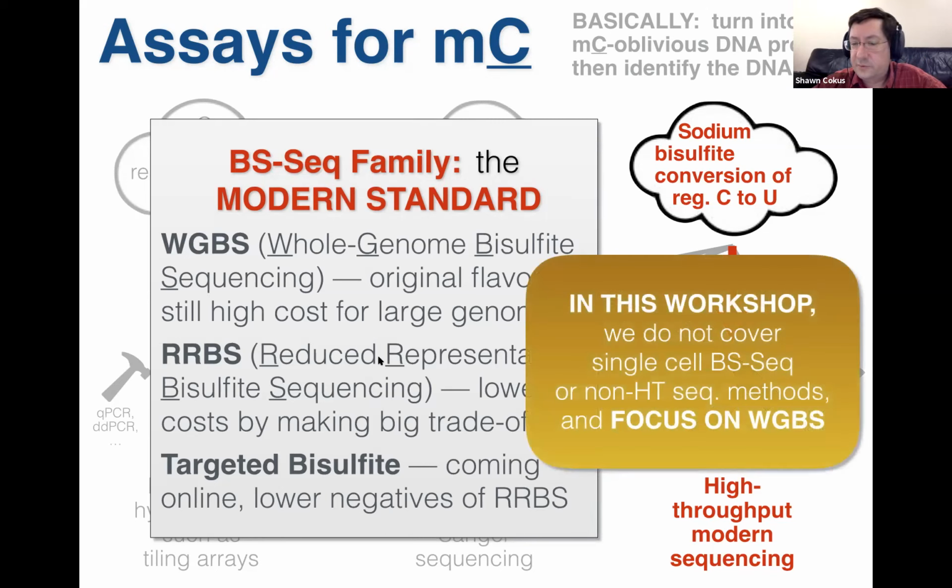So in the workshop, we're not going to really cover single cell, which I didn't even mention there, or the non-high throughput sequencing based methods, and we're going to focus on WGBS. The rest are really specializations of it. They do have analysis issues that are important and interesting, but there's a limited amount of time we have in 3 days. So we're going to focus on WGBS.